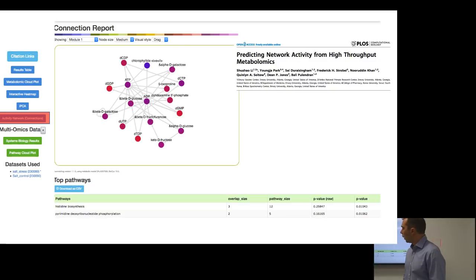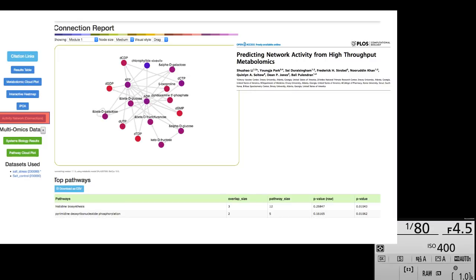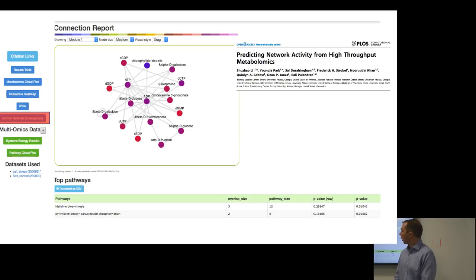And then finally, there is the systems biology workflow, where we use the Mummichog algorithm, which was published first by Professor Lee out of Emory University. That paper, I believe, was quite some time ago now. And this is very nice. I'm not going to go into any detail about it because Erica will speak in much more detail about this later today.